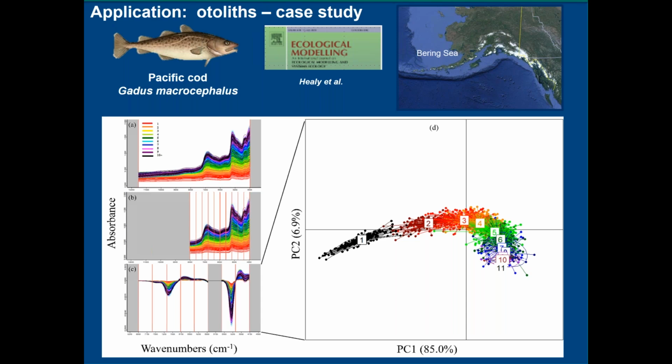One thing we have to keep in mind is that in order to develop calibration and validation and to validate that model, we have to pair the traditional age information up with the spectral information. So to the extent that the traditional age information is horrible, that is going to basically be problematic for the age estimation from FT-NIRS as well. So like I say, in all cases, it's not a technology that will be broadly extended.